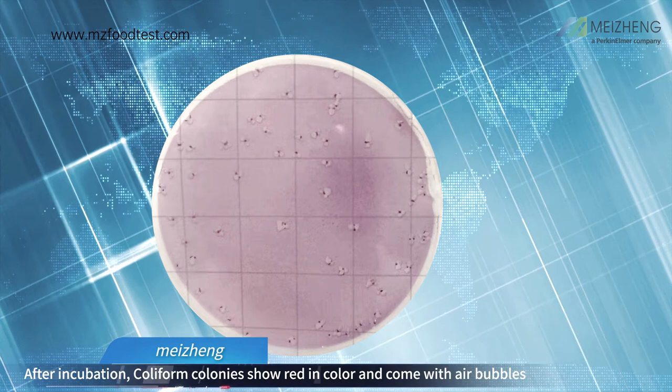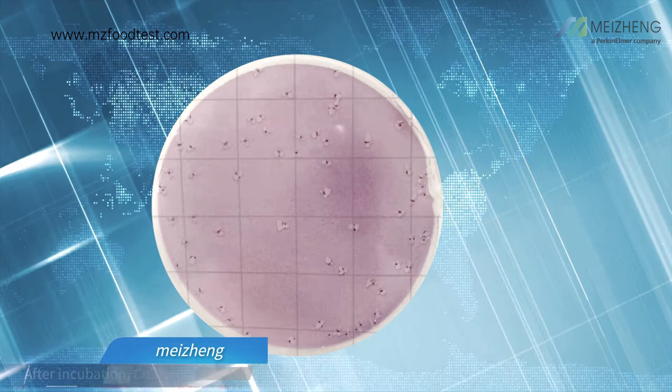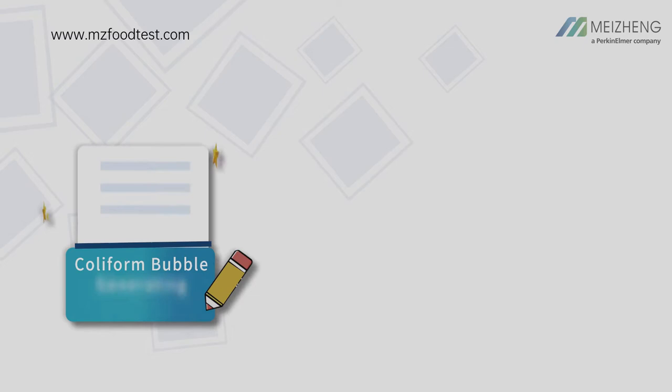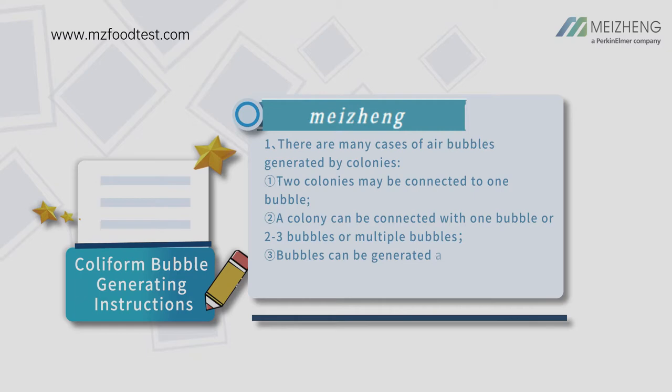Interpretation: After incubation, coliform colonies show red in color and come with air bubbles. Count visually or use a colony counter or illuminated magnifier. Counting range is 15 to 150 CFU. Coliform bubble generating instructions: there are many cases of air bubbles generated by colonies.